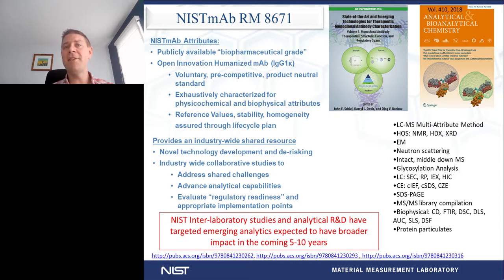It's intended to be voluntary, meaning that manufacturers of biopharmaceutical products are not required to use this material, but we hope that they use it as sort of a product-neutral standard that they can use for the internal and external collaborations, making any data that's generated about this molecule pre-competitive that the entire community can utilize to advance the field further. The material has been very exhaustively characterized.